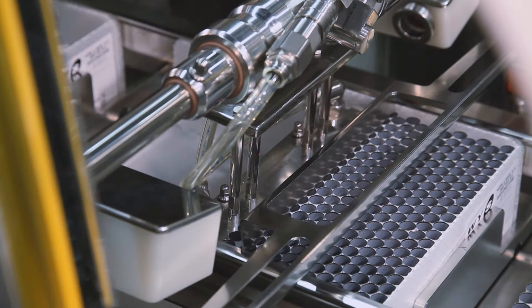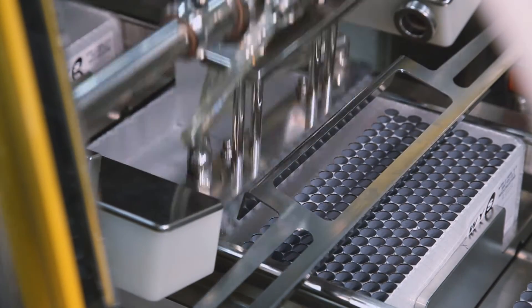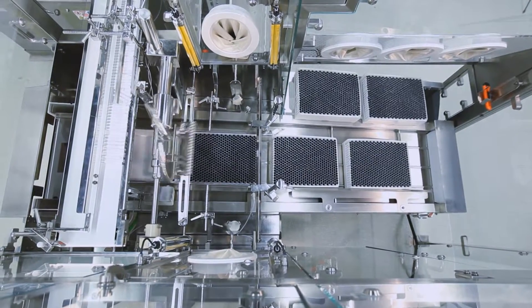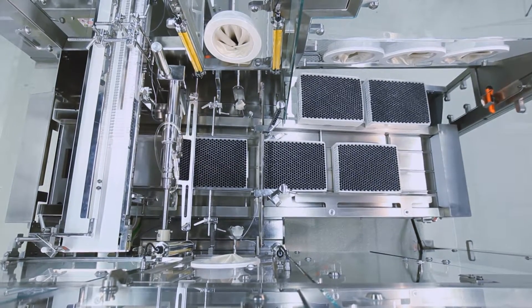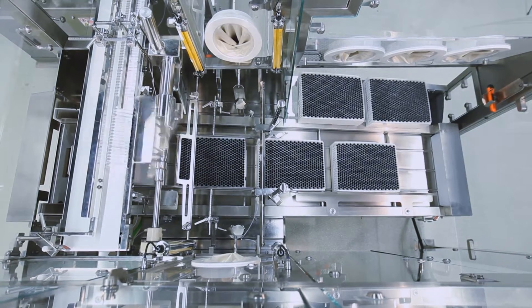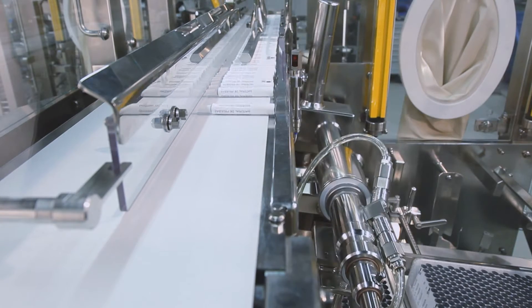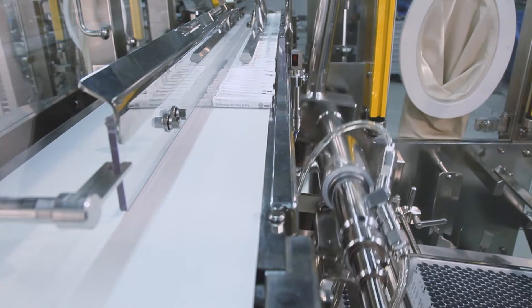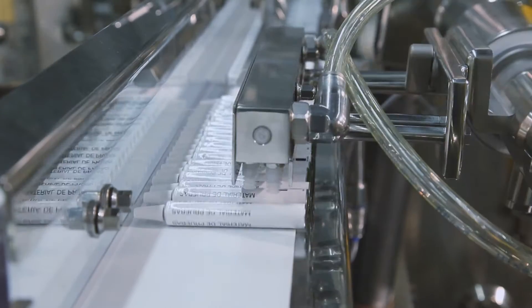In this execution, the trays with the open tubes are manually placed by the operator under laminar flow on the infeed conveyor of the tube loading device TZX-01 Sterile. The trays are indexed through the machine and unloaded row by row by the TZ suction arm. A fully automated tray lid removal and tray loading into the machine is also available. An important fact is that the unloading arm sucks the tubes from the outside and does not go with gripping fingers inside the tubes. This design avoids the risk of contamination of the tube inside with particles.